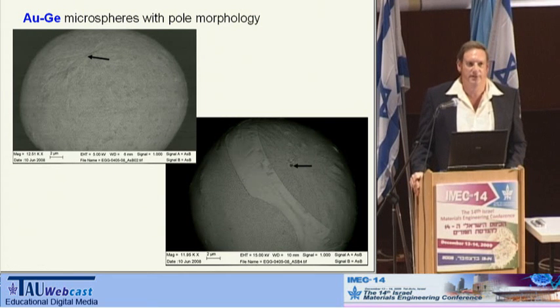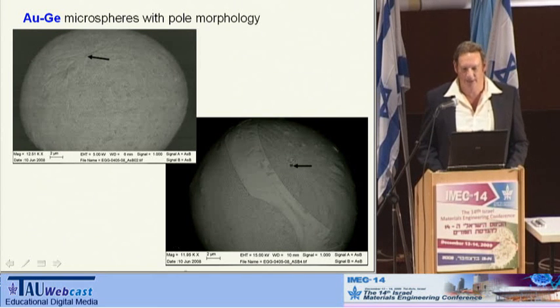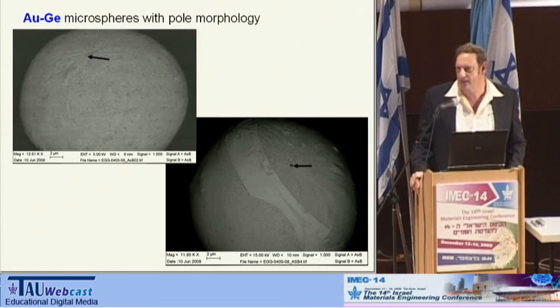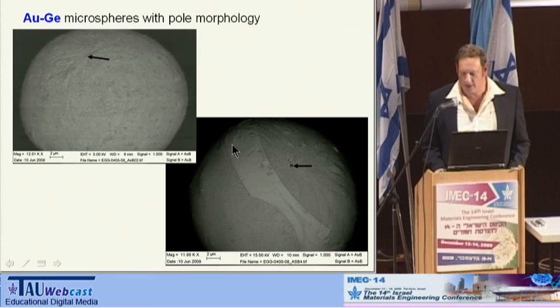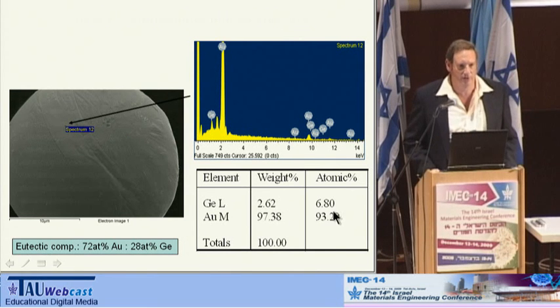These are micrographs of two of the spheres that we got, and as you can see, there are several interesting features. For example, they have a pole morphology — there are lines going from one point out in all directions. Second, you see that there are some bright spots and dark spots. Dark spots are the germanium, where the bright ones are the gold, meaning there is phase segregation on the surface. On this one we've got a bright stripe, which is gold only. EDS analysis on the surface shows that anywhere else outside this stripe, we see some enrichment of germanium versus its eutectic composition, and the gold concentration is lower. However, if we concentrate on this stripe, you see enormous enrichment of gold, almost pure gold.